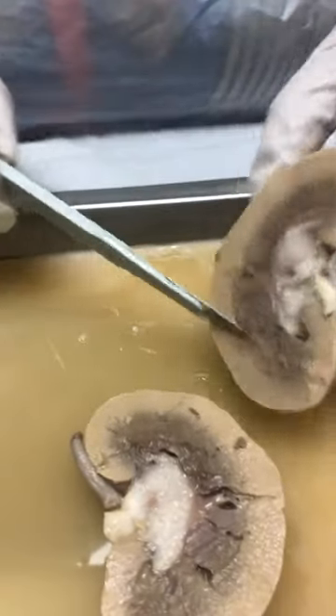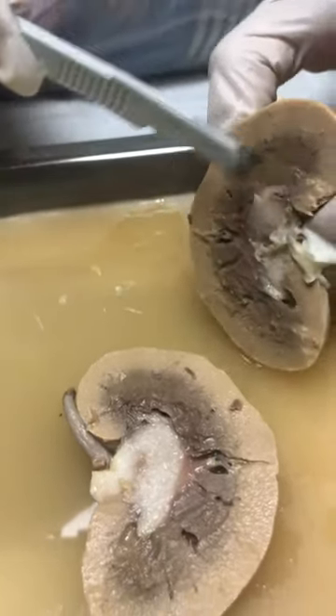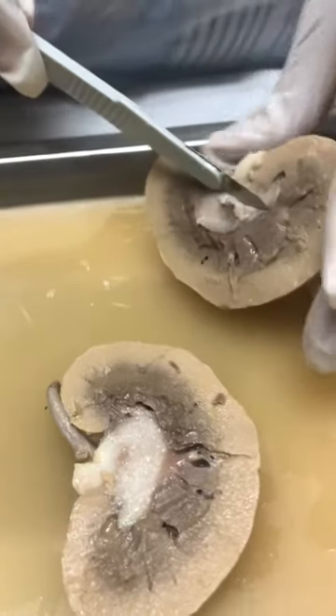I'm going to try to slice them off because it didn't slice completely even and I don't know if I damaged it. I don't want to damage my finger.